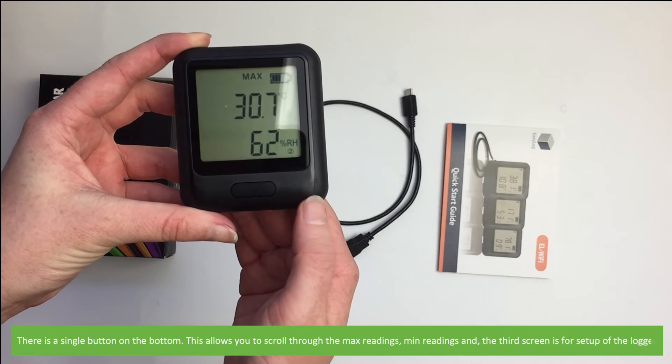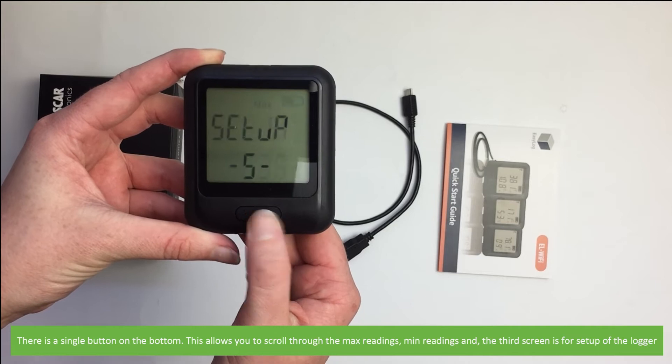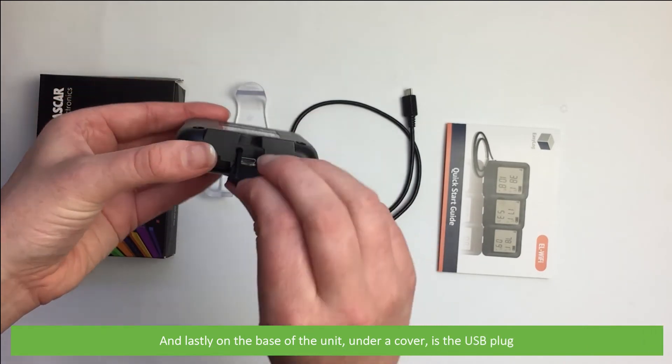There's a single button on the bottom. This allows you to scroll through the maximum readings, minimum readings, and the third screen is for setup of the logger. And lastly, on the base of the unit under a cover is the USB plug.